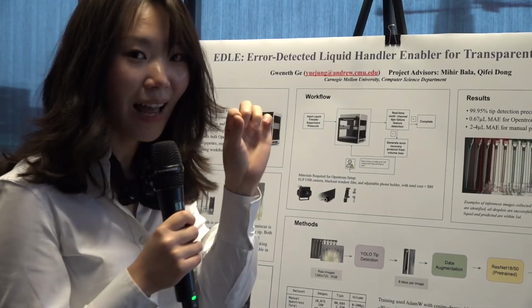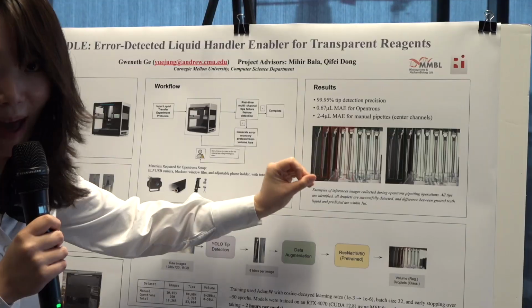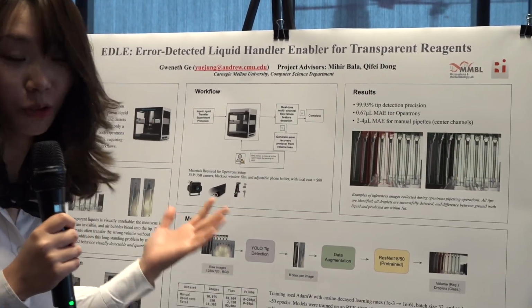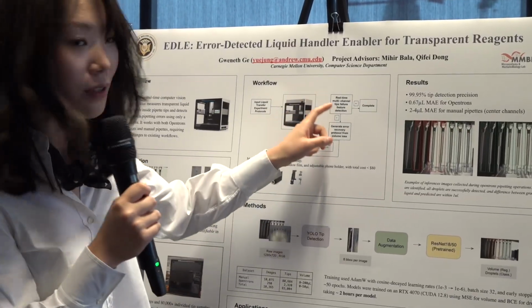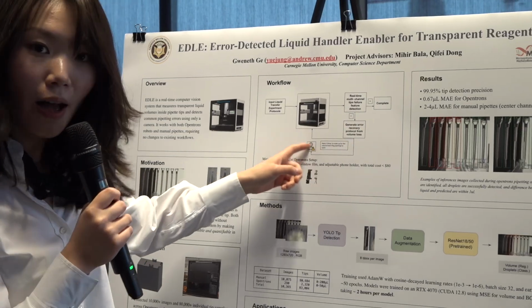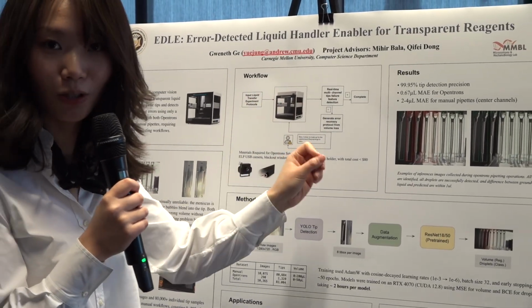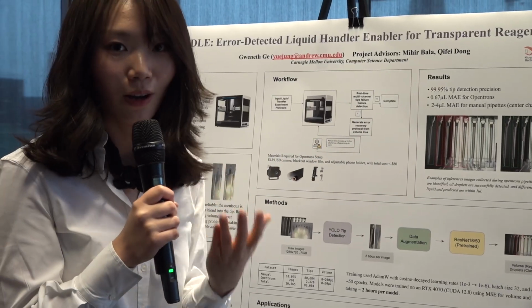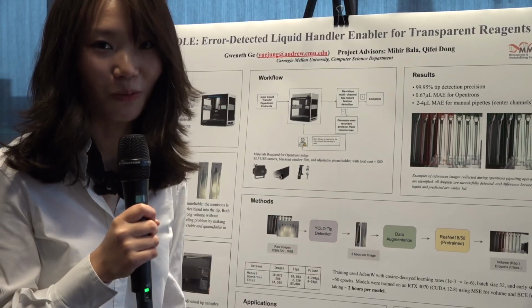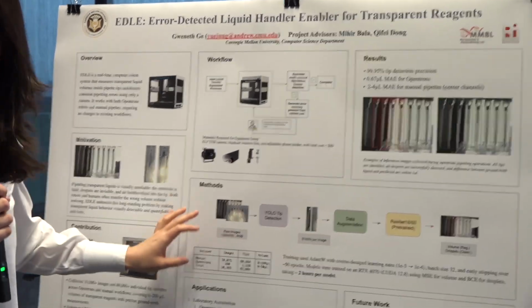Droplets are the tiny bits, like circles, hanging down from the pipette tips, which might cause cross-contamination of your samples, and that is really bad. If something wrong is detected, like droplets or wrong volumes, it will retry 3 times in the Opentrons itself and send warnings to users. I just want you to know earlier, rather than at the latest moment when you have to discard the samples. Okay, and this is the workflow. I won't go into details.